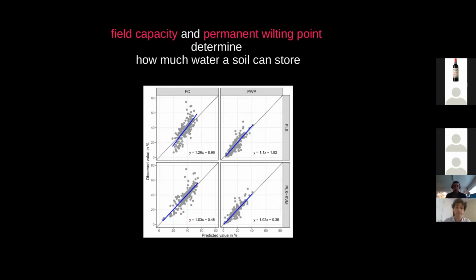But it's unfortunately a very, very expensive and time-consuming thing to actually measure in the lab. It takes several days and specialist equipment. It's a complete dog to measure, and it's very expensive. So in this case, being able to calibrate models predicting those two parameters directly from spectroscopy with a very decent accuracy. Of course, not a one-to-one line, but it still gives us that quantitative measurement that can be actioned on.